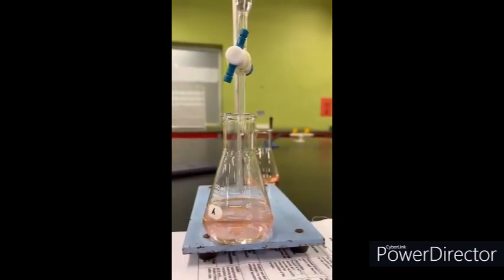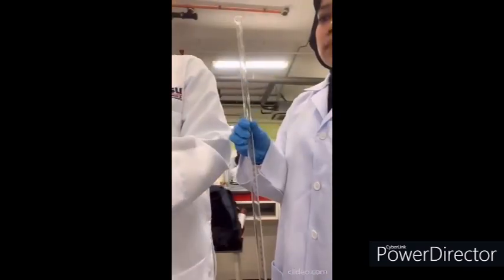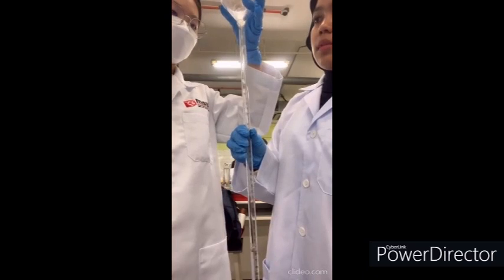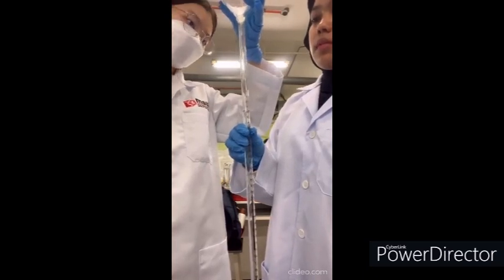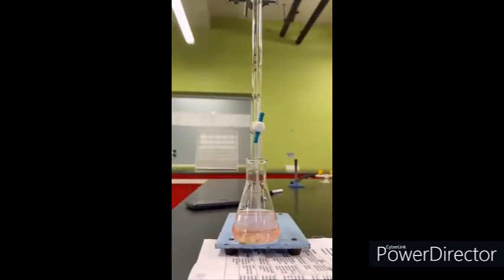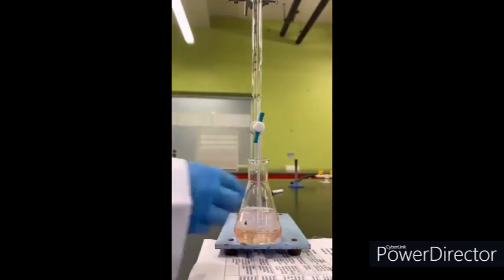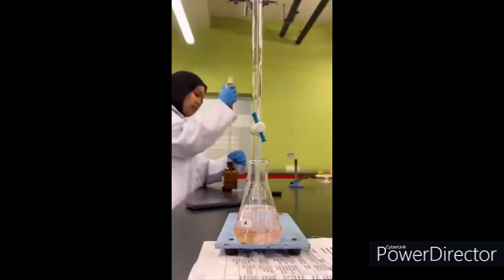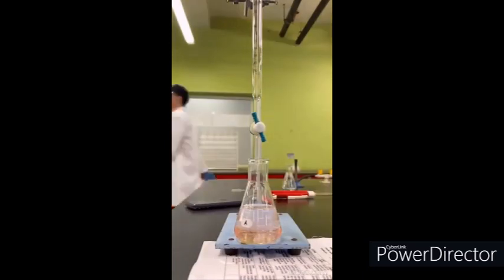The solution becomes a lighter pink. As the sodium hydroxide is insufficient, another burette is filled with the sodium hydroxide until it reaches the 0 mark again. And then, the titration is continued with the refilled burette. At this stage, the color of the solution is still pinkish, which shows that the solution is still acidic and it has not reached the neutral state yet.